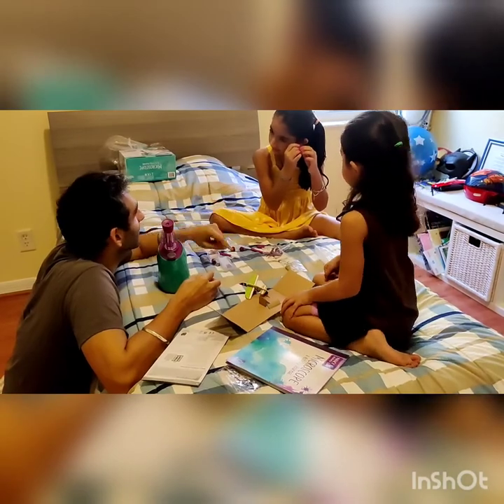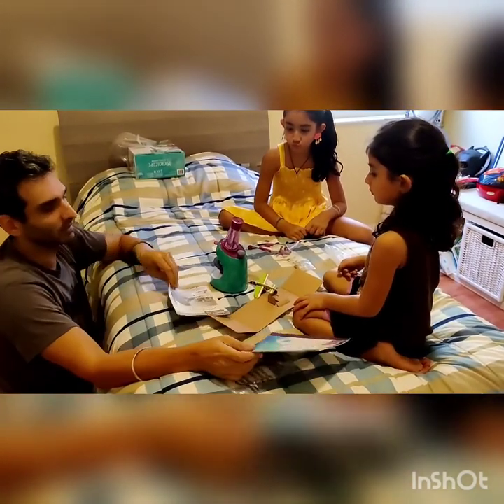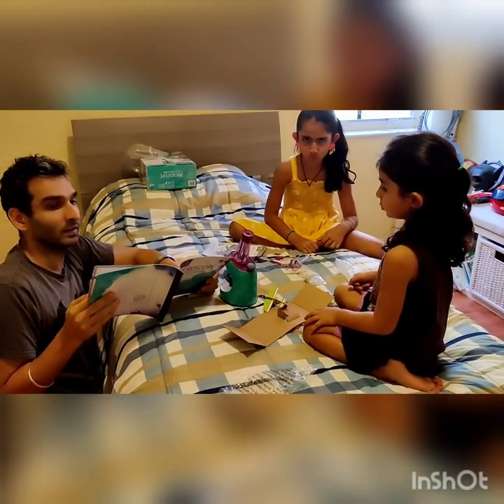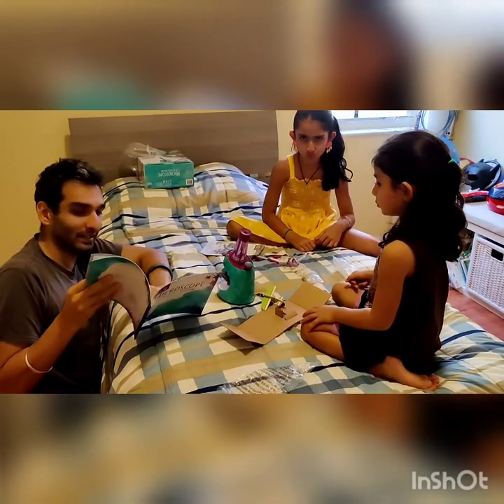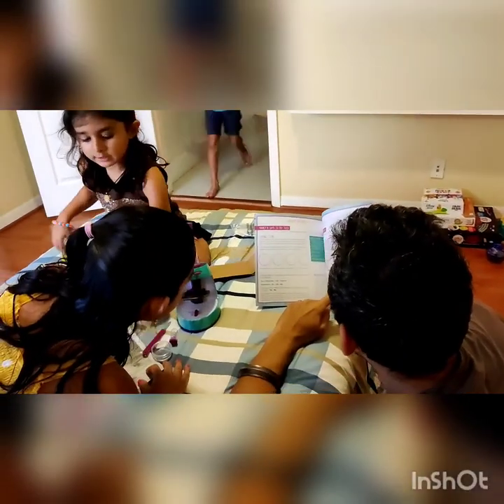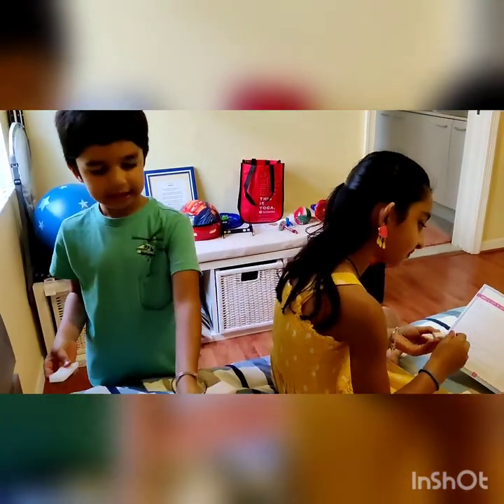Not hair, onion. So you have to read what parts you can do. Here are the instructions, and here's the activity journal. You have to write what you found. You see all the cells, different cells stuck together. Each cell has a dot, the brain of the cell. It says nucleus. Can you read nucleus?